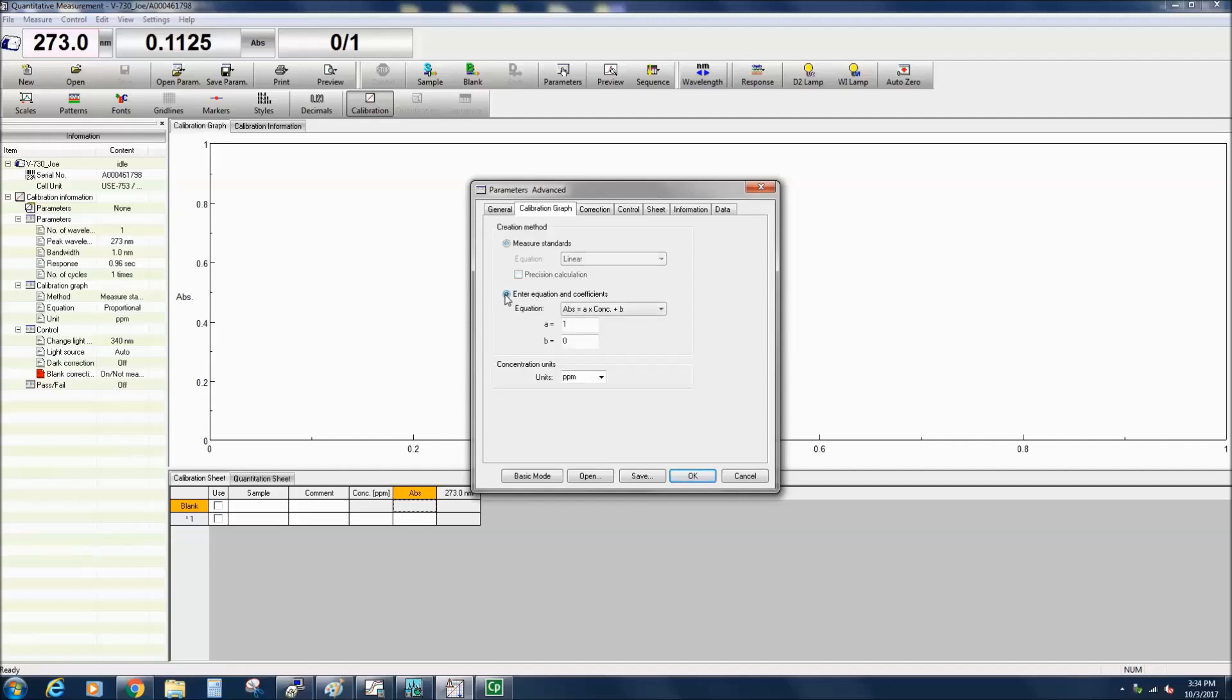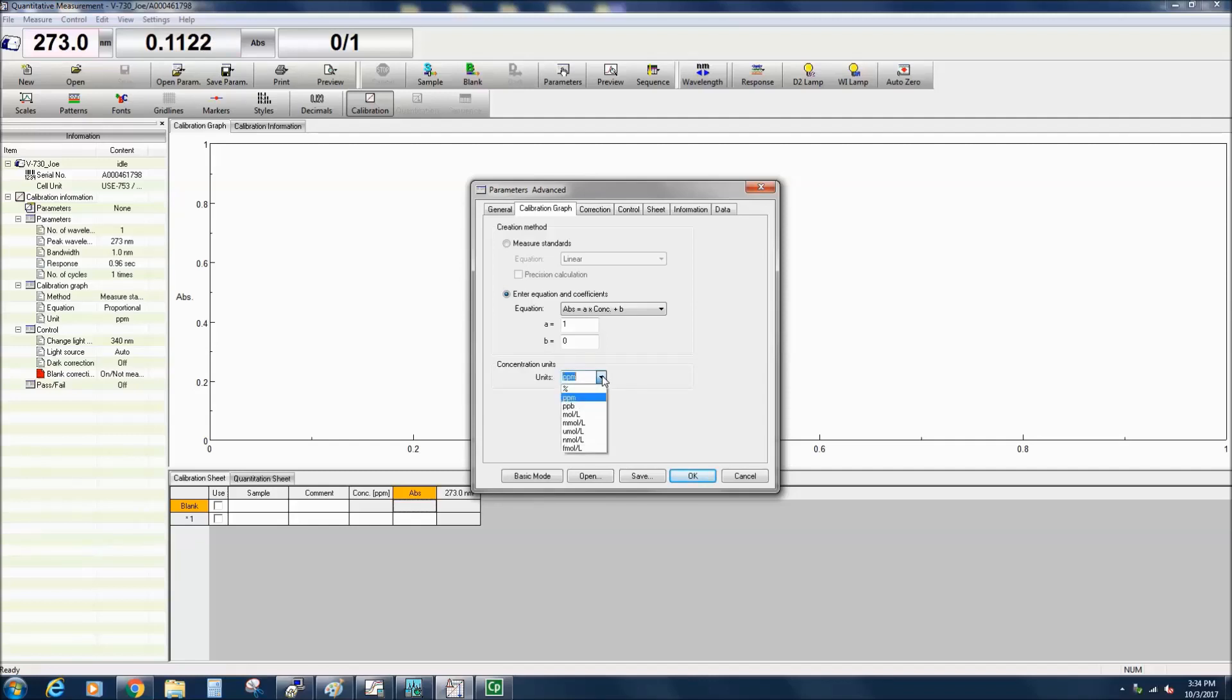You can also enter your own values for the slope and y-intercept by selecting the Enter Equation and Coefficient option. There are numerous concentration unit options, however you can also enter your own concentration units if they do not appear in the drop-down list.